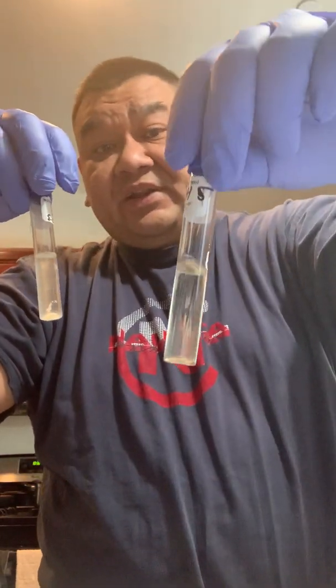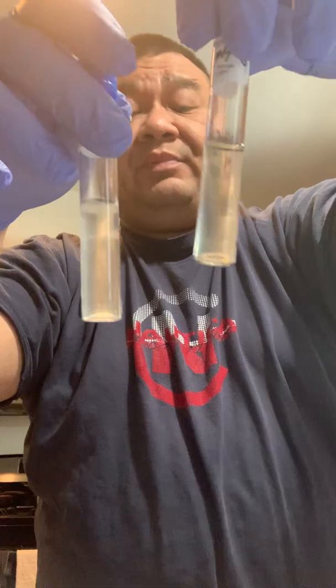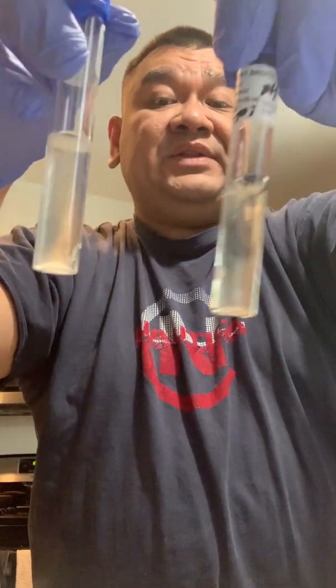Here is my epidermidis. This is my pH of 5, cerevisiae at pH of 5. No growth. So my epidermidis shows no growth. This here is actually wax from the candles. All my tubes for this experiment had it, but as you could tell, it's clear broth compared to the cerevisiae, where it's cloudy.